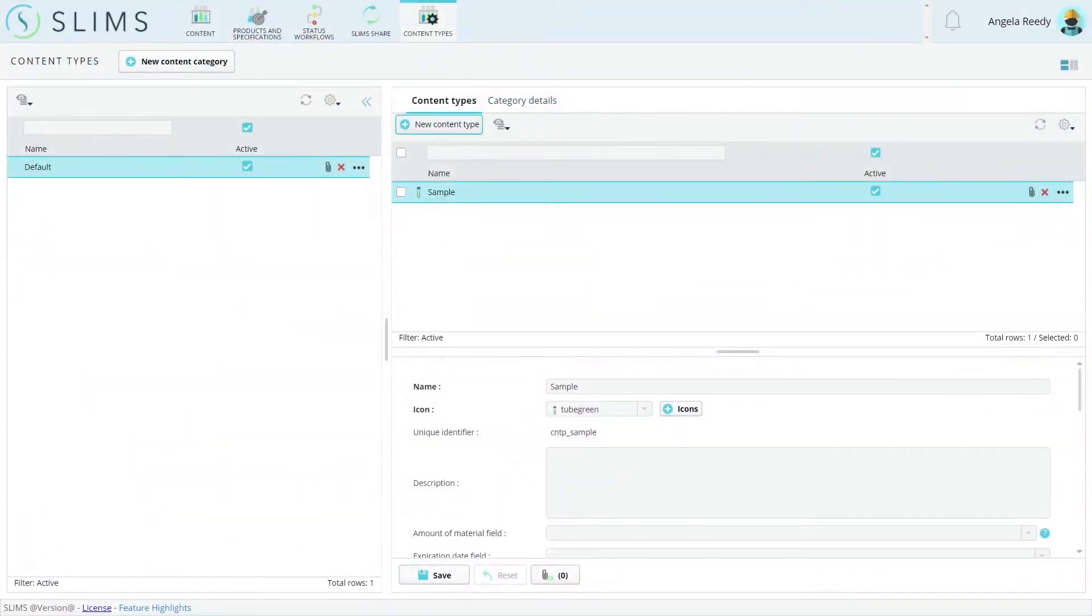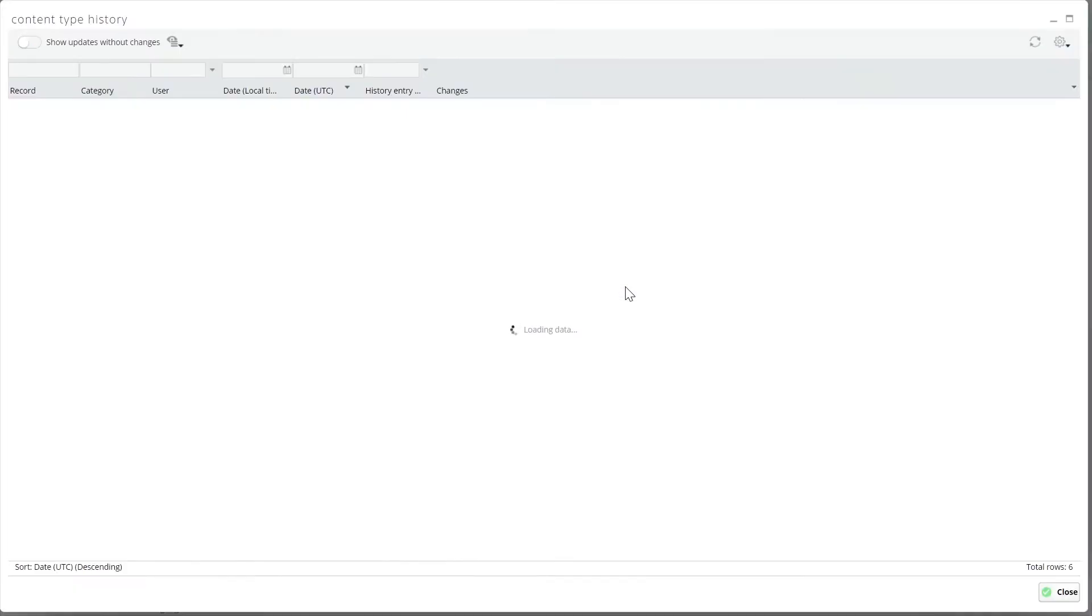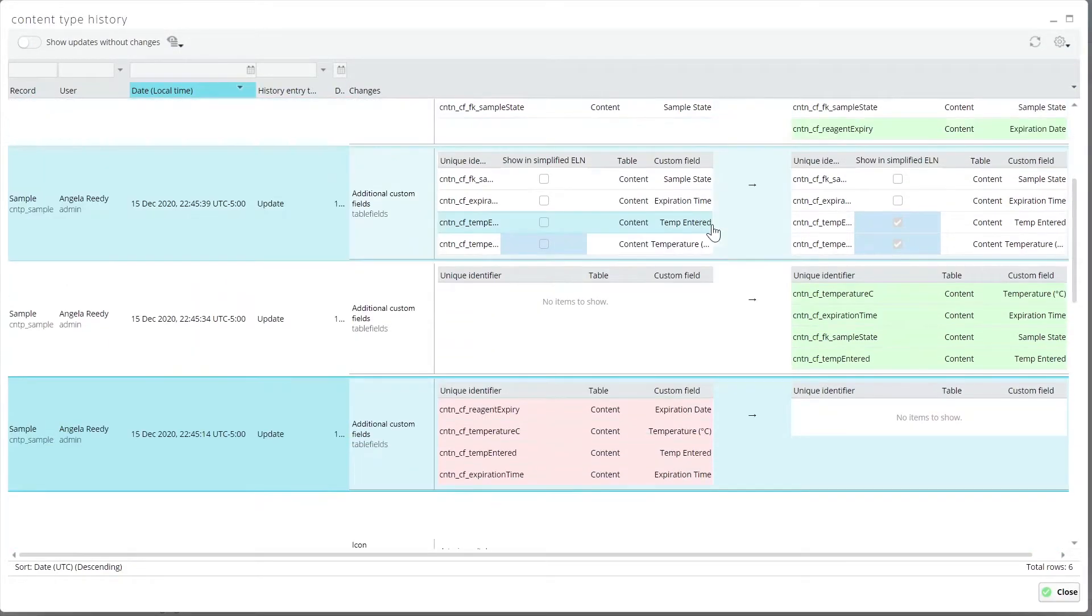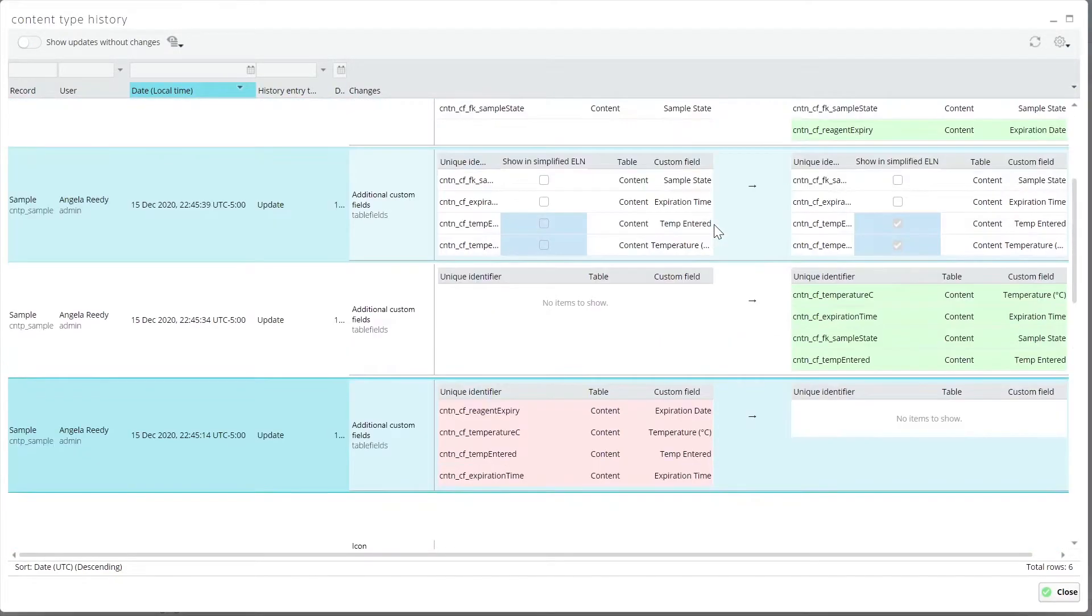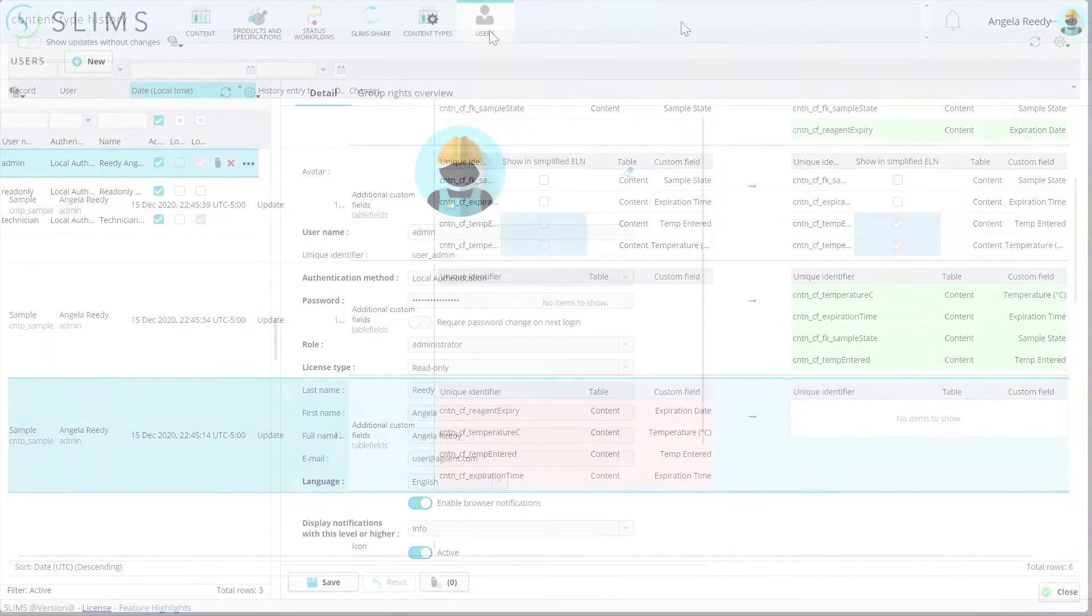Many-to-many fields are easier to understand in history grids now. They are represented by a grid in the changes column that shows updates in blue, additions in green, and deletions in red.